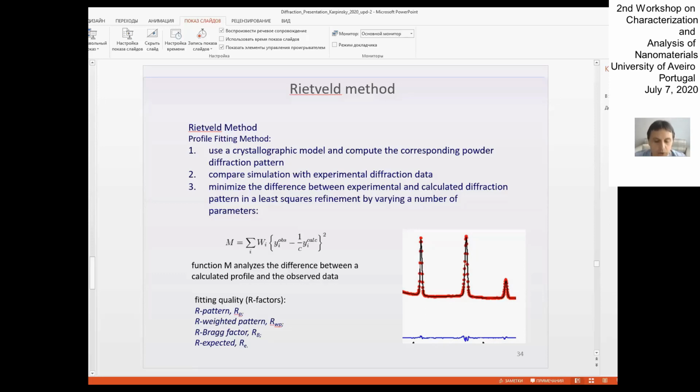But in the software, it's also possible to estimate the most probable models, for different crystallographic and symmetry groups. Yes, exactly. There is a lot of theoretical data. You have to put in the information about the chemical elements, the unit cell volume, and the diffraction pattern, and the software will try to estimate the most probable models and symmetries which can be. Okay, good. Thank you very much.